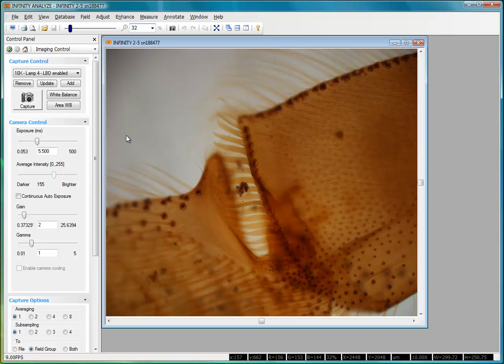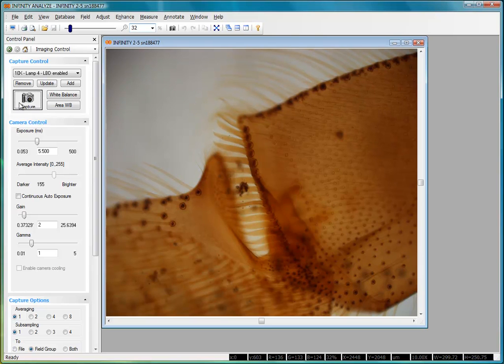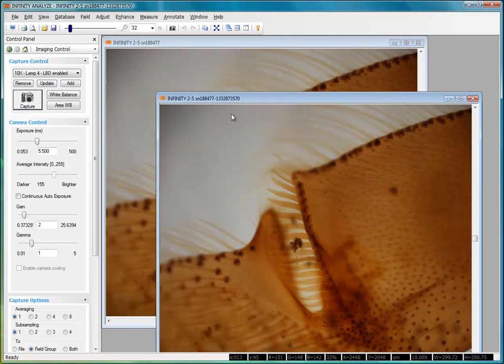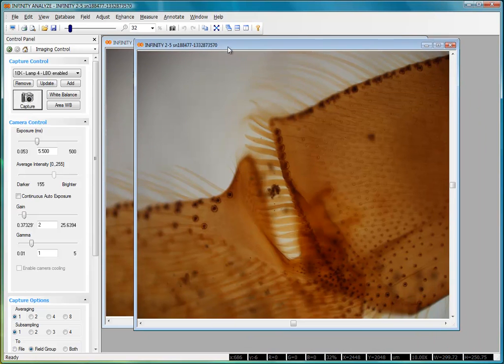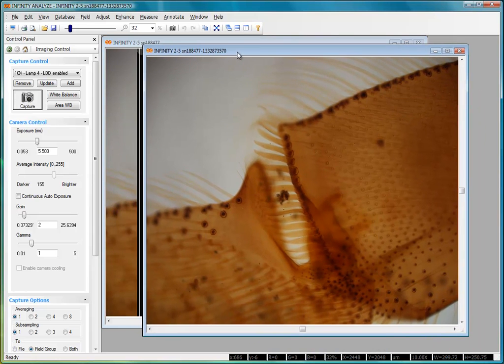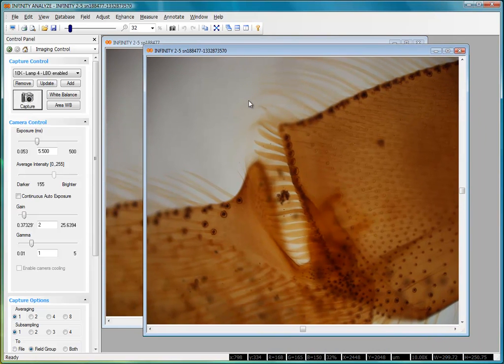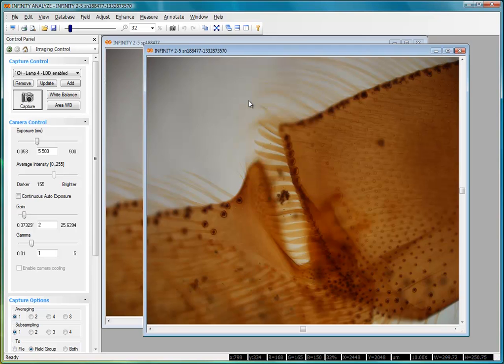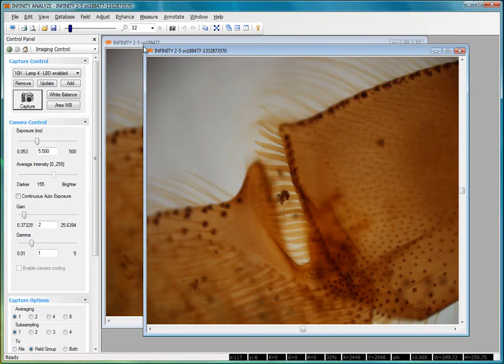The zoom function also works on captured images. If I click the capture button, we get a captured image the same as our live preview. If I pan or move the live preview, the captured image remains intact.